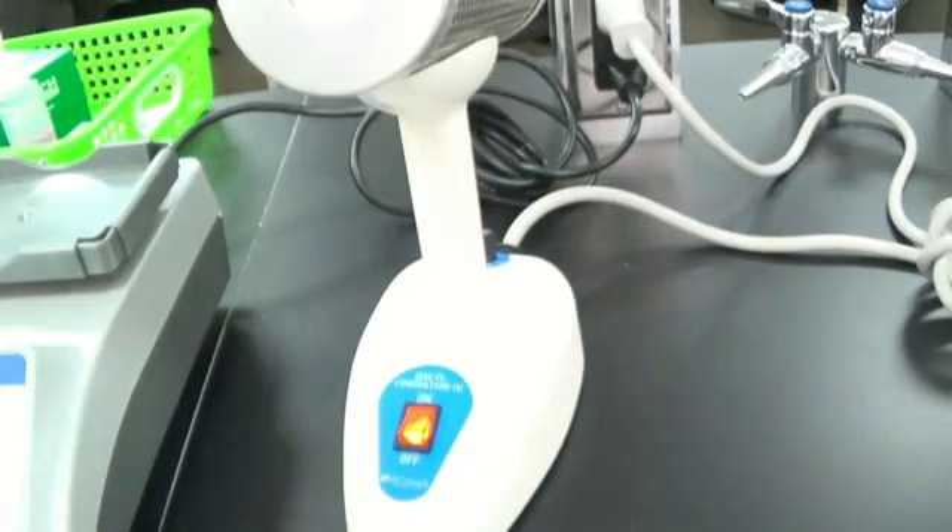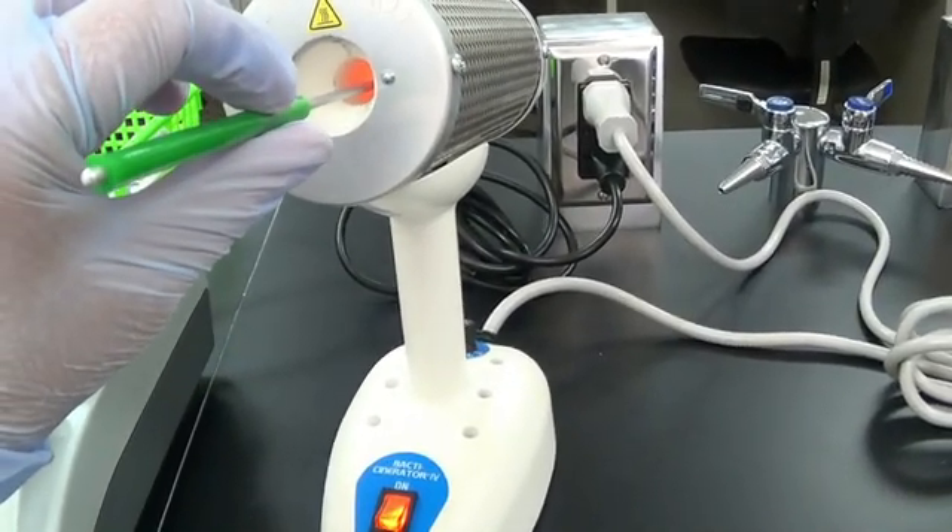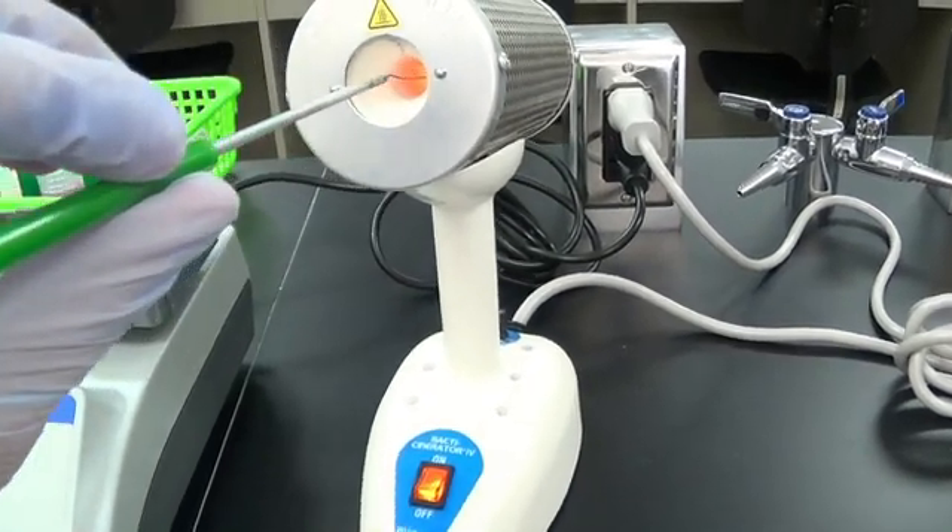When you are done, sterilize the loop again — count to four. And there you go.